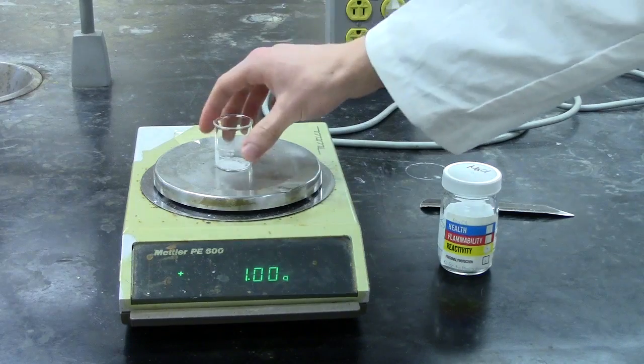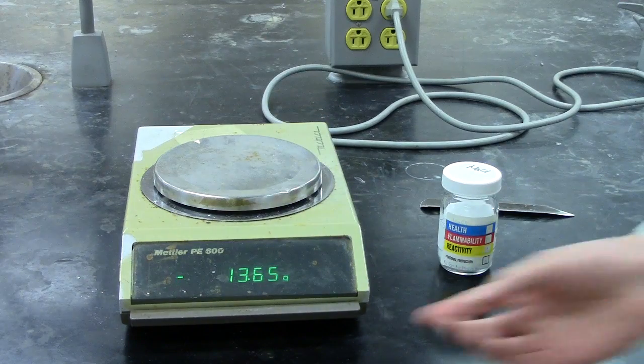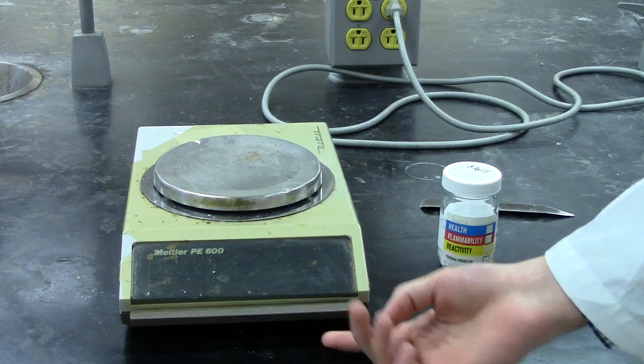Once you have your mass you can take your weighed substance and turn off the balance by lifting up on the lower bar.